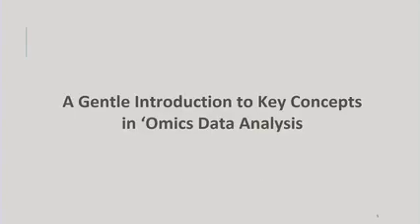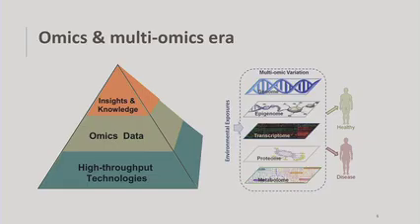And in the next few slides, I'm going to mention the general concepts behind omics data analysis. And this is very true: our group not only developed metabolomics tools, we actually work a lot on microbiome and RNA-seq and even multi-omics. And there's a strong pattern associated with all the omics. So if you understand this part, you can easily understand the RNA-seq and microbiome data analysis using tools developed by our group.